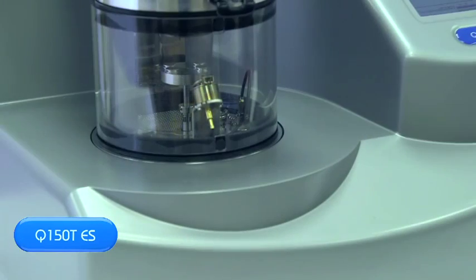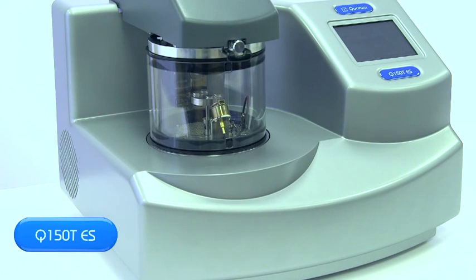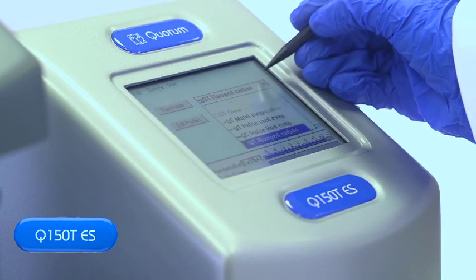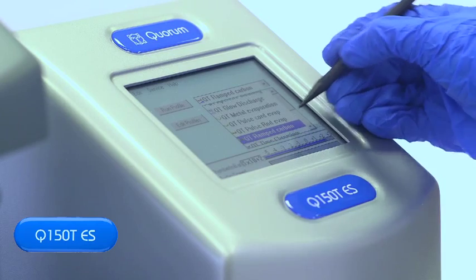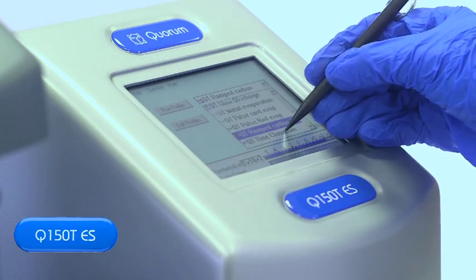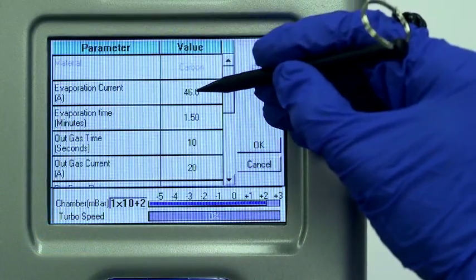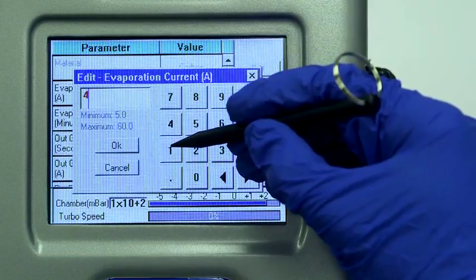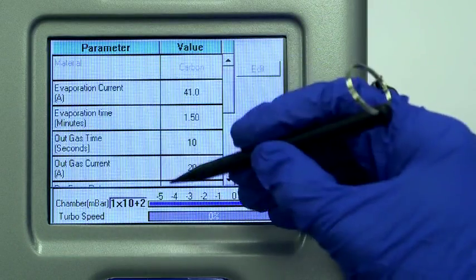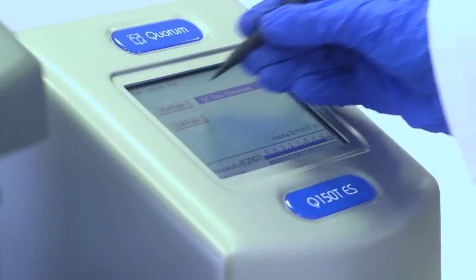The system was developed from a common platform with versatility in mind. All models have the same touchscreen user interface with intuitive menu options, allowing each user to create and store their unique coating profiles, to adjust material types and system functions, or to access historical coating records from a data logging system.